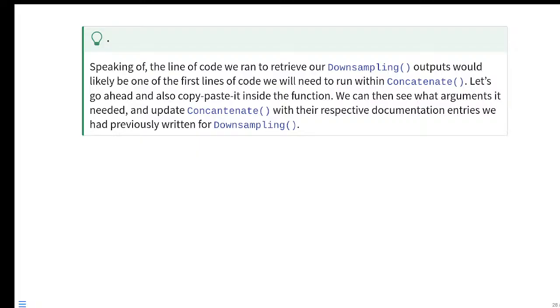So Lucia, it would probably be dependent on files that are acquired on the same instrument platform. If I had data from one Aurora with the same laser configuration as data from another Aurora, you would be able to concatenate those two files together. However, if it's on a different type of Aurora platform with different lasers that would have different detectors, then no, I would not be able to combine those together.